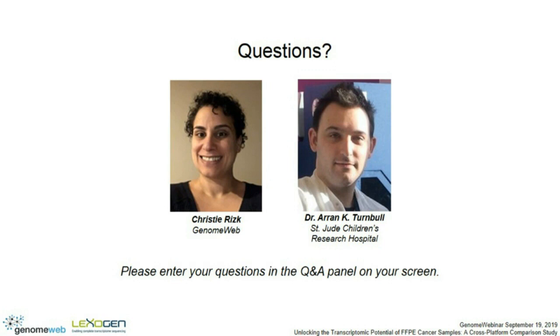And apart from the technical quality control recommended by the manufacturer, can you talk a little bit about what the evidence was that whole transcriptome analysis was meaningful for 10-year-old FFPE samples? So yeah, essentially, what we basically did is we've taken analysis of high-quality, fresh frozen RNA-derived microarray data that we've produced over the last few years, that we have extensively analyzed. And what we did is apply that analysis to these FFPE tissues.